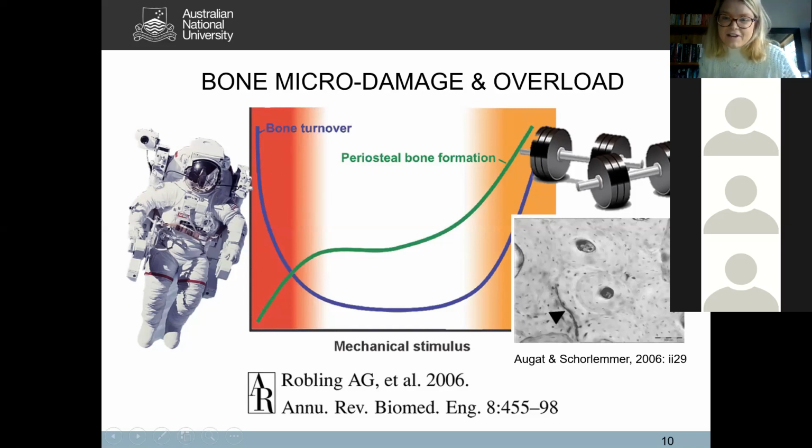And if the mechanical stimulus increases to the point where you're overloading your bones regularly, for example, if you're doing a lot of pretty intense weightlifting, I think that's probably the best example. So anything that's weight bearing, but you're overstimulating your bone tissue, what your bone histology will show is something like this. You see here, it's a microcrack. This microcrack is what we refer to as micro damage. So it's not a big fracture, it's essentially a mini fracture in your histology, and that then needs to get remodeled away. And so you then see an increase in remodeling.